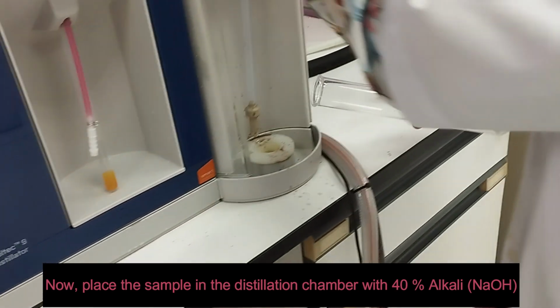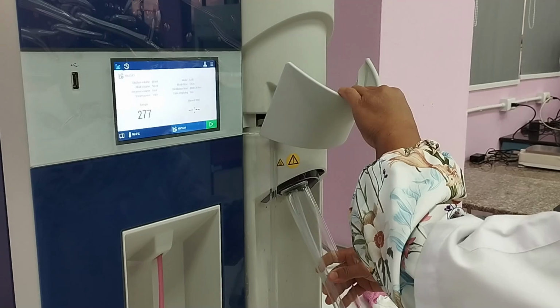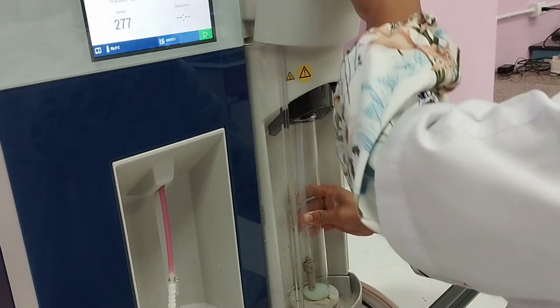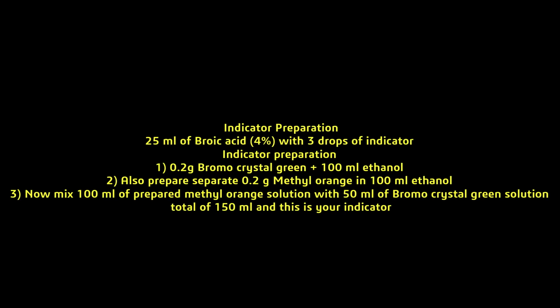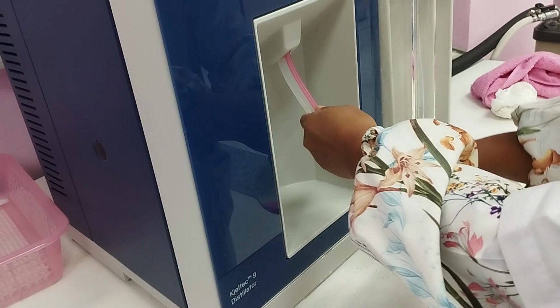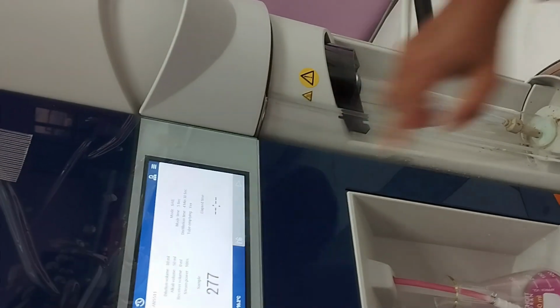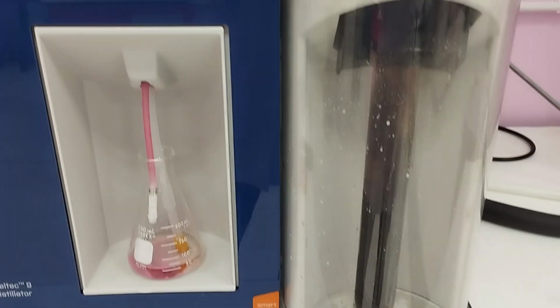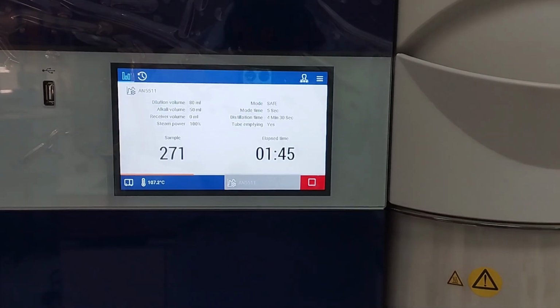Sample last. See, first up, down, and then put into the distillation chamber. This one is with boric acid and the indicator. Okay, and then start. This is the distillation process being carried out.